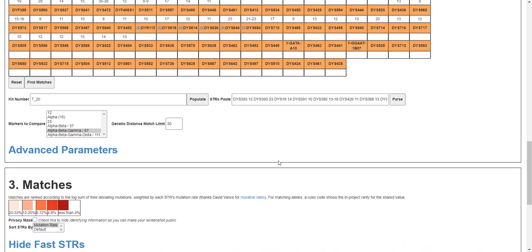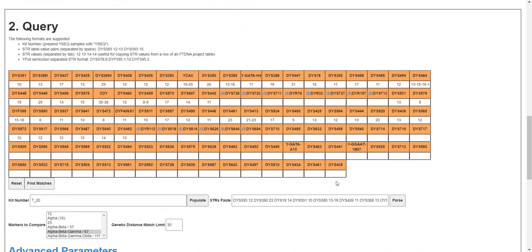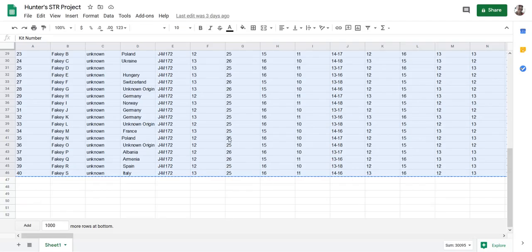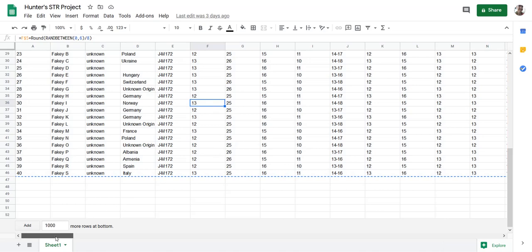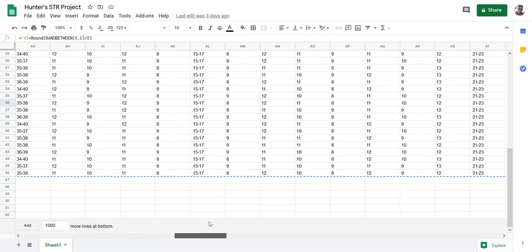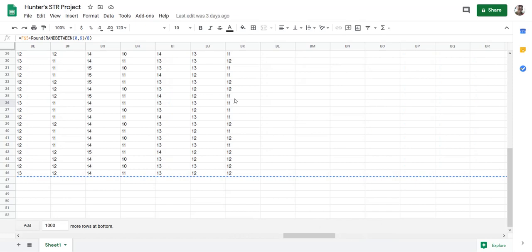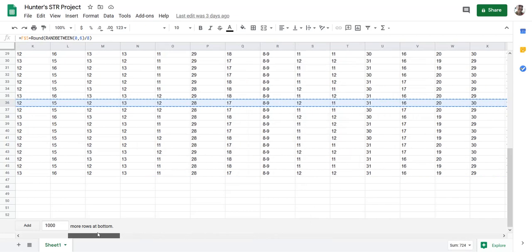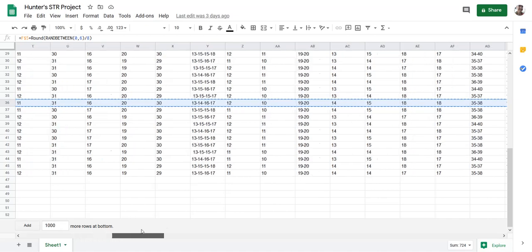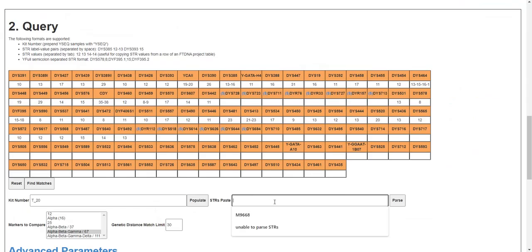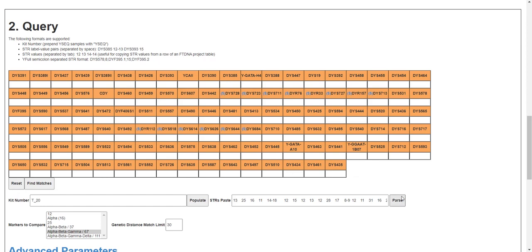Okay, so yeah, that's how you can use STR match finder. If you have data in this format, that is the standard order used by Family Tree DNA projects, you could just copy this row and paste it in here, STR paste. It parses it, this is what it looks like. You can reset if you want to just clear, but now I'll parse it and you can see it actually loaded everything. So that's easier than typing it in manually.